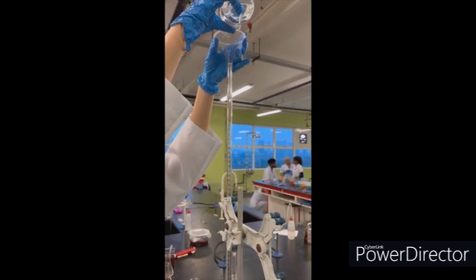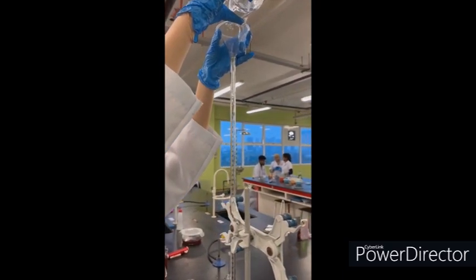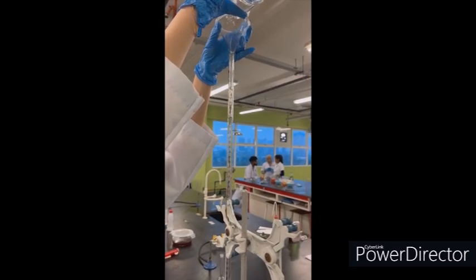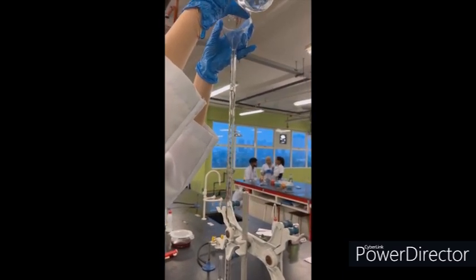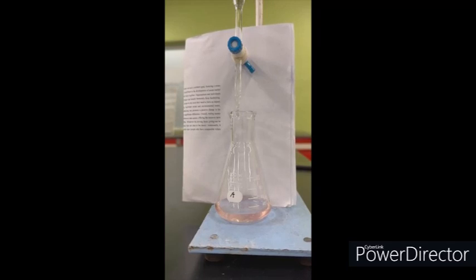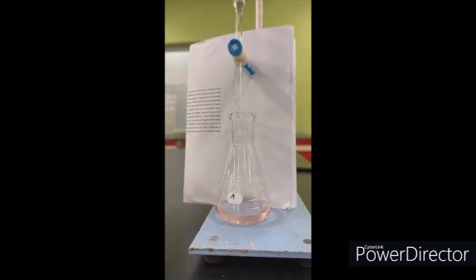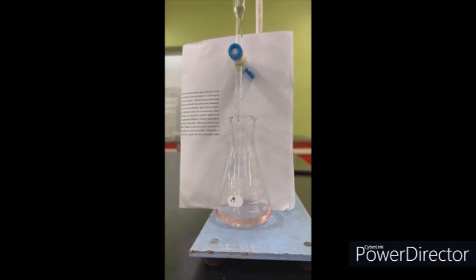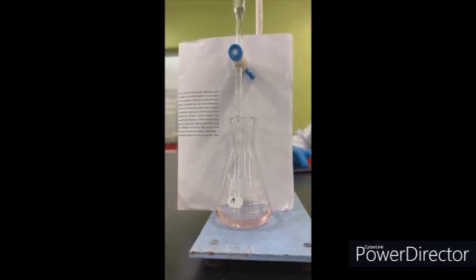After that, we fill the burette with 0.2 molarity NaOH solution until it reaches the zero level line. It's a total of 50 ml NaOH in the burette. Conical flask A was left under the burette stand for the titration process. We can see the drops of NaOH solution falling from the burette into the conical flask. At the same time, a white paper was placed so the color change could be seen clearly.